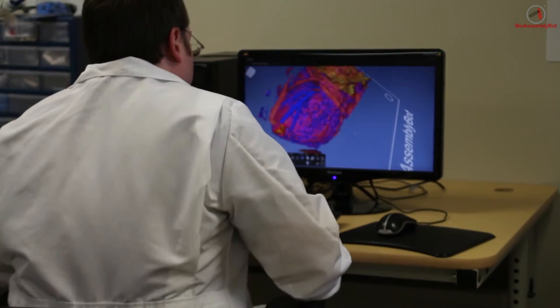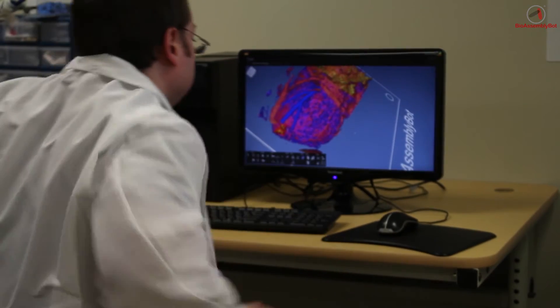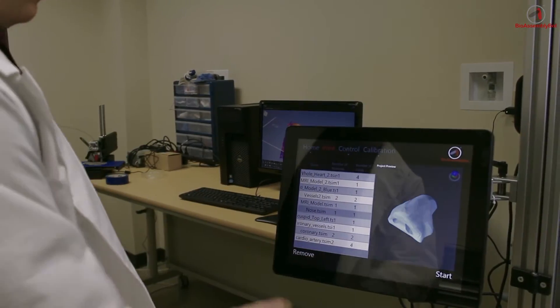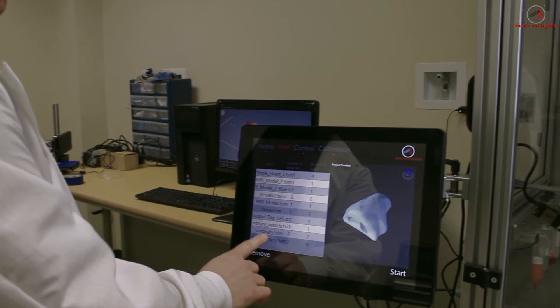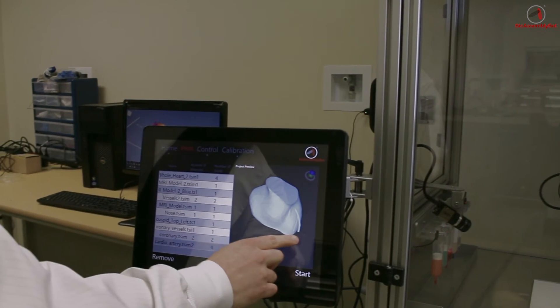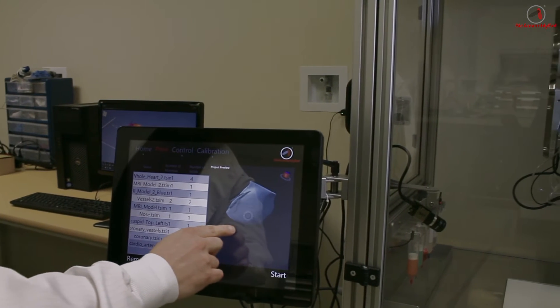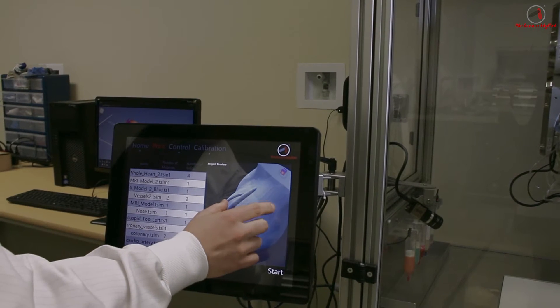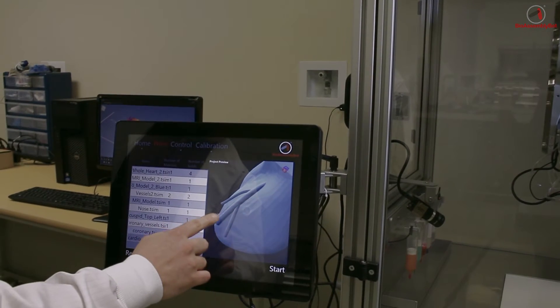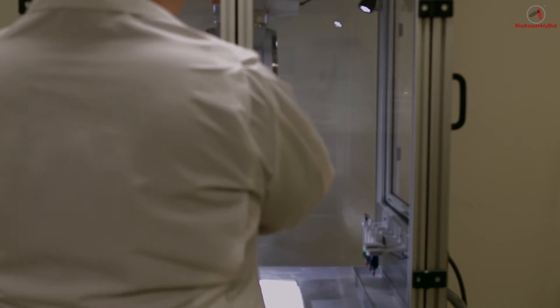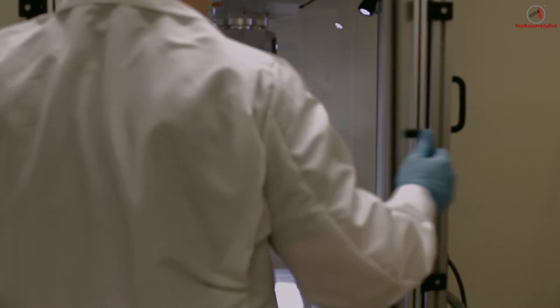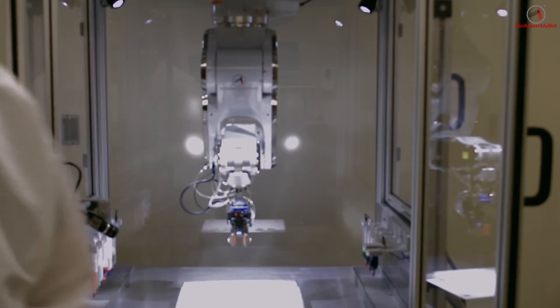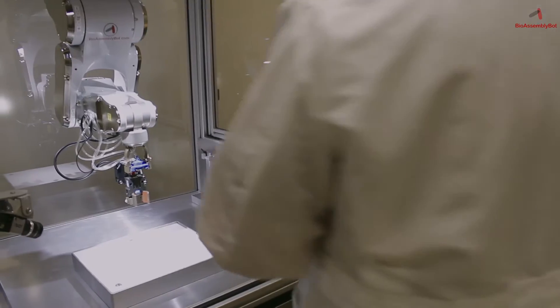Here the technician has finished the project, sent it over to the BAB bioprinter, and has chosen the project within the project list, is verifying that's the structure he wants to print, and now is in the process of loading in the proper materials.